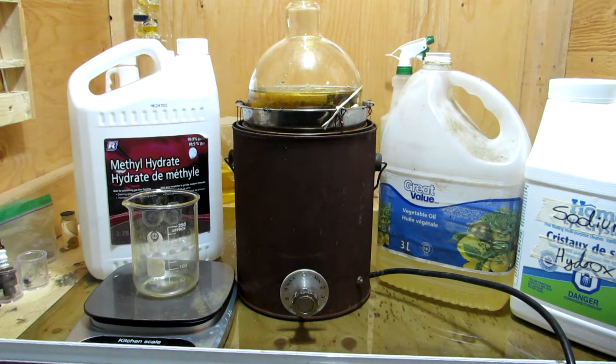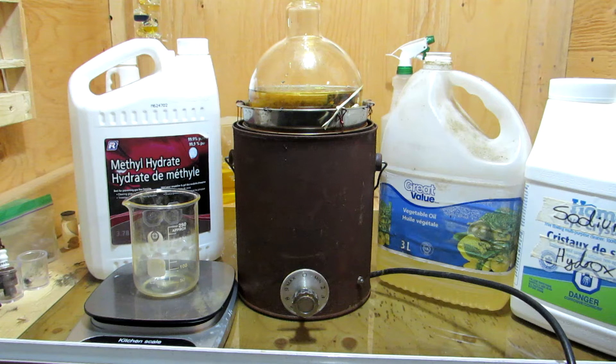Hey guys, and welcome back to another video. Today we will be producing glycerol through the transesterification of triglycerides found in vegetable oil.